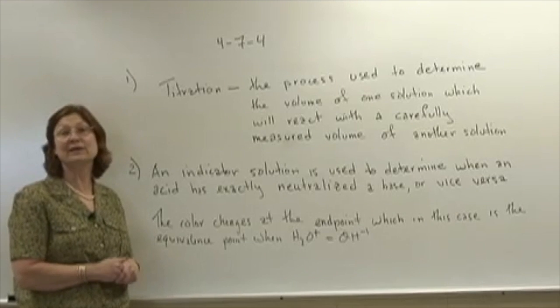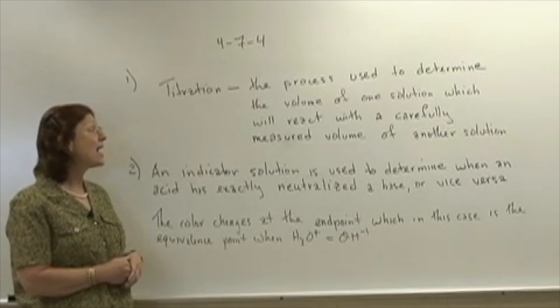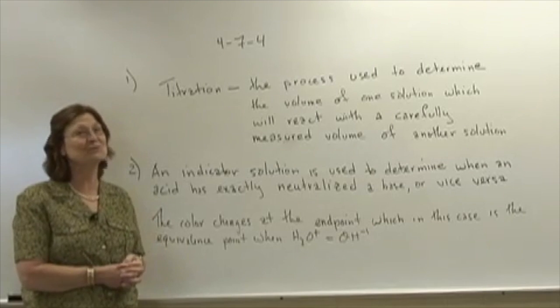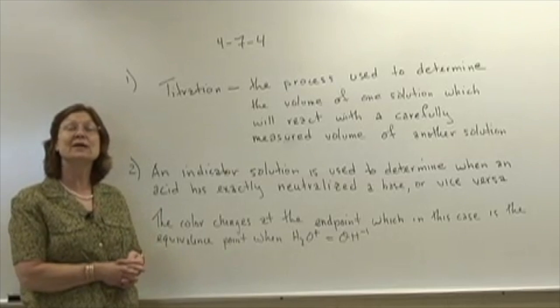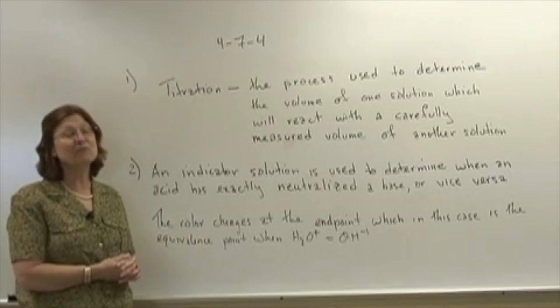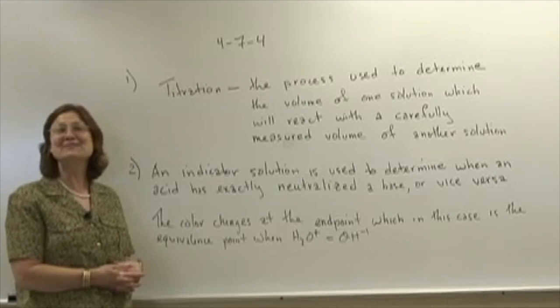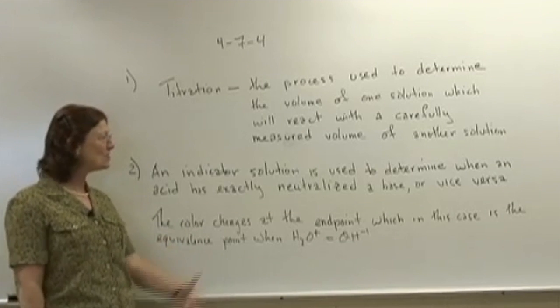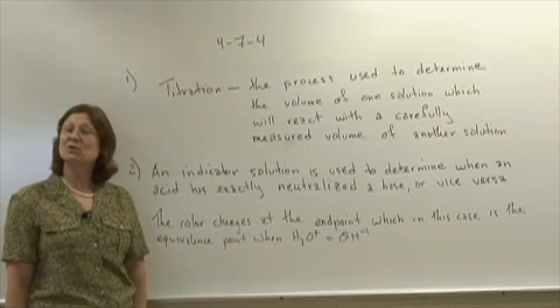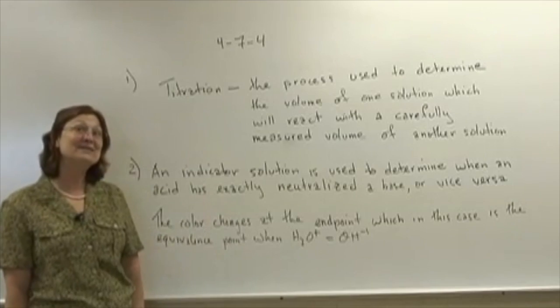Titrations are found in many, many ways, and this is a very instrumental lab for you to understand because you will see it very often in chemistry these days for a variety of different reasons, and therefore we must have the experience of doing a titration. Plus we love doing lab. Now that we've gone over the warm-ups, I will introduce some of the equipment in the lab, and then we'll be able to go into the lab.